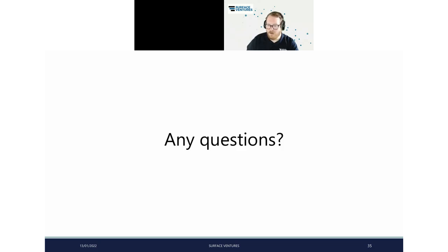Thank you. So there are 3 more questions. We'll take these and then we'll proceed on to the demo. We've got one question here, a similar question from Gene. We deal with a solid surface. Most samples have, I presume, a significant roughness. Wenzel or Cassie-Baxter needs some geometric parameters of the surface. How do we evaluate the surface energy of the surface without knowing it? I presume that's without knowing the roughness.